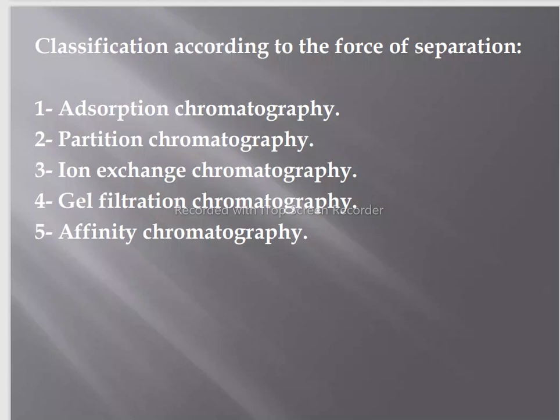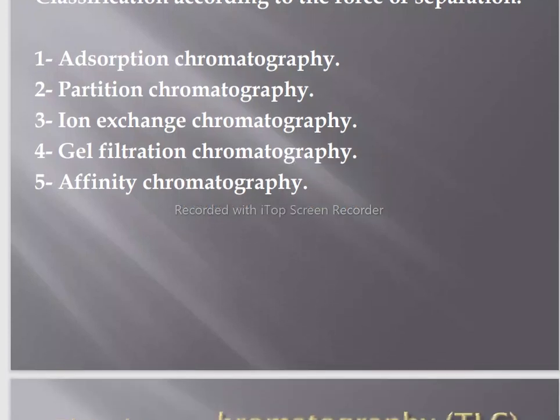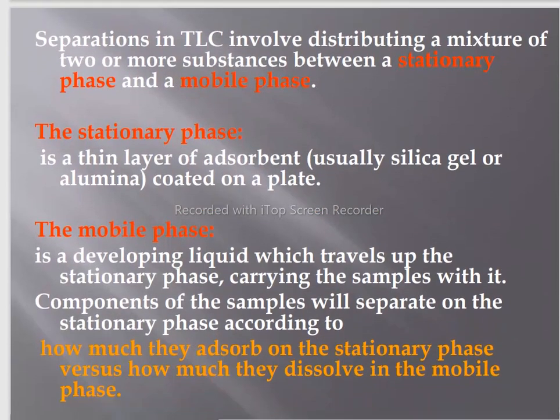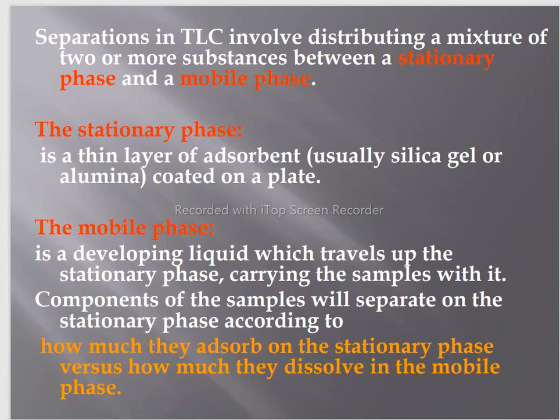Okay friends. So now we have to discuss what is thin layer chromatography. Thin layer chromatography or TLC is a method for identifying substances and testing the purity of a compound. TLC is a useful technique because it is relatively quick and requires small quantities of material. Separation in TLC involves distributing a mixture of two or more substances between a stationary phase and a mobile phase.